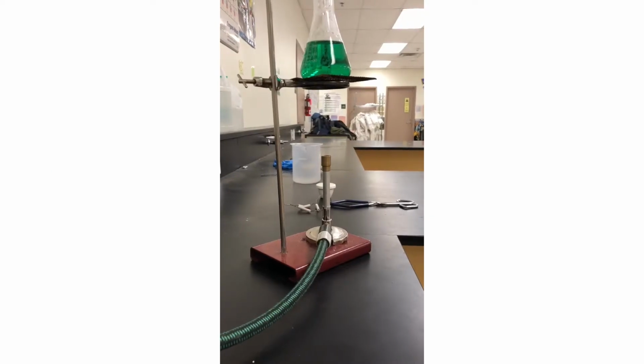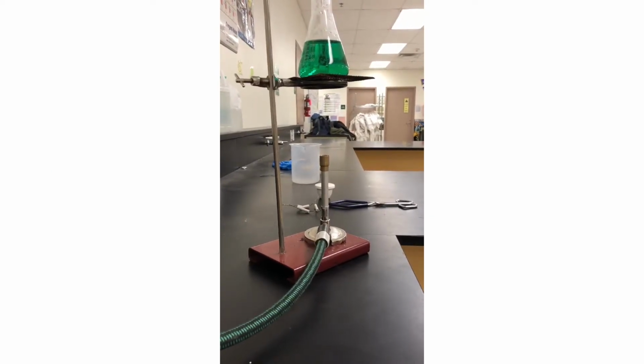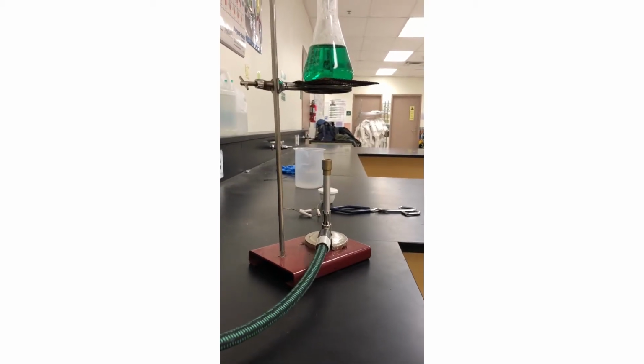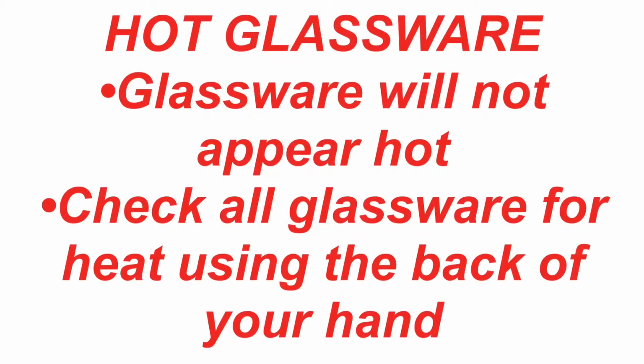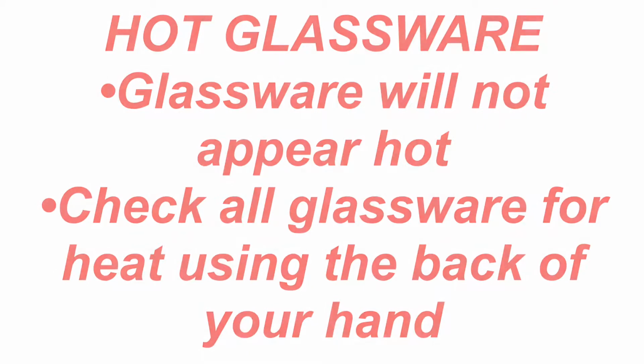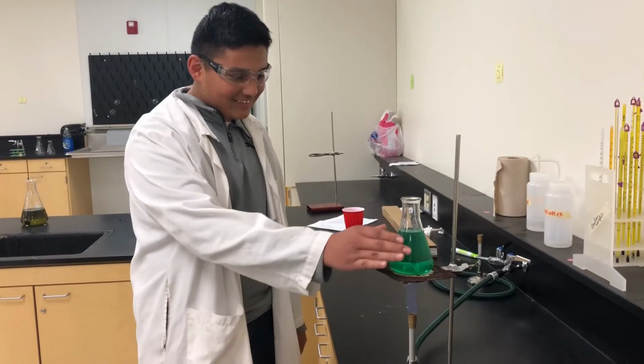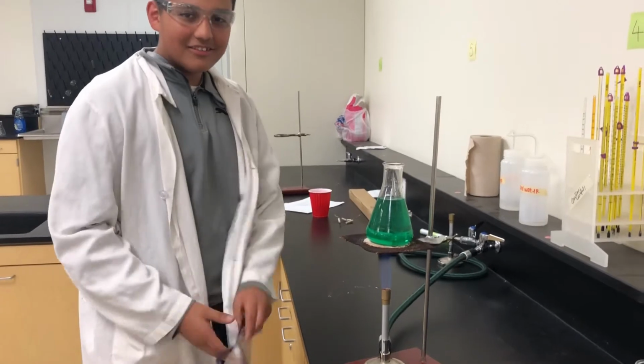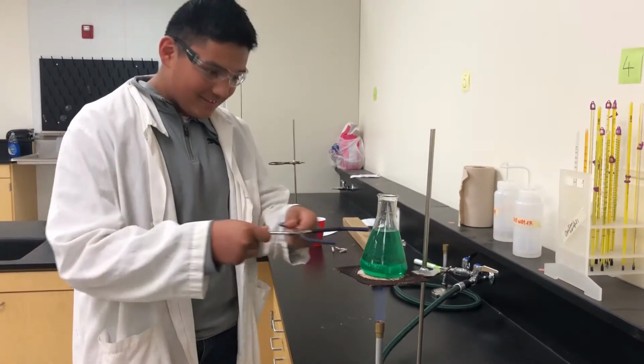Do not rapidly change the temperature of glass, either from very cold to very hot quickly or very hot to very cold quickly. No, it's hot! It doesn't look hot. This is hot. You need tongs.